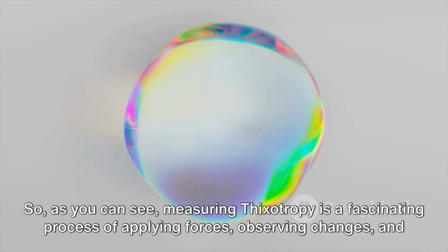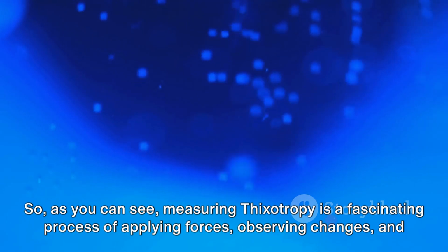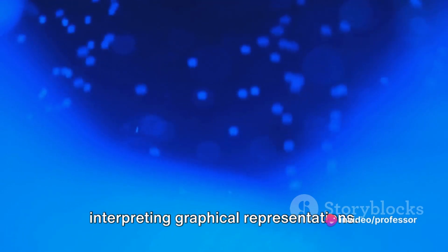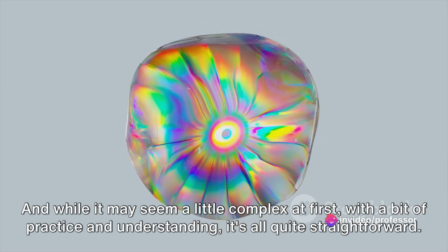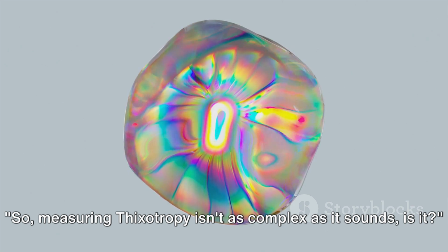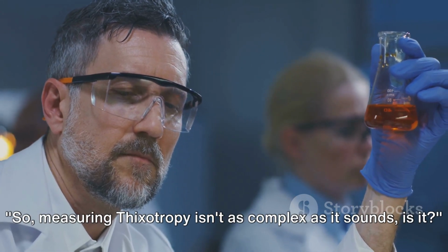So, as you can see, measuring thixotropy is a fascinating process of applying forces, observing changes, and interpreting graphical representations. And while it may seem a little complex at first, with a bit of practice and understanding, it's all quite straightforward. So, measuring thixotropy isn't as complex as it sounds, is it?